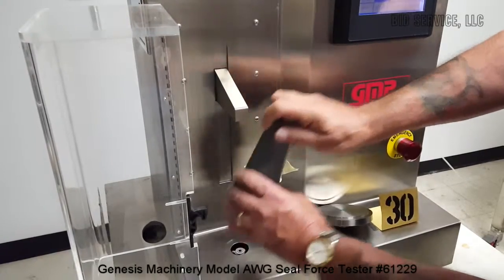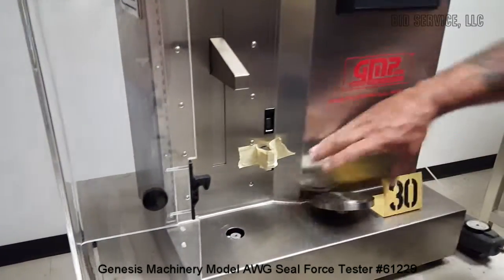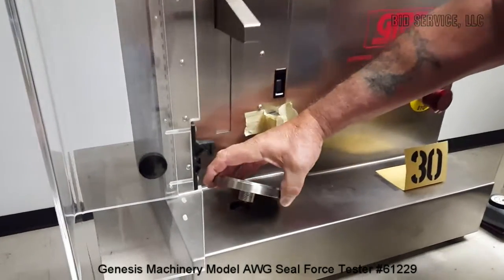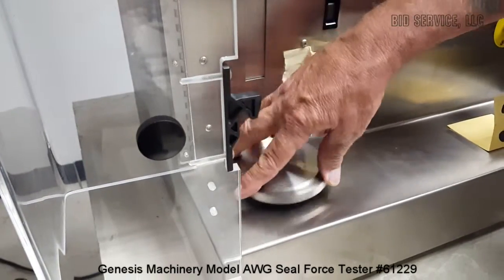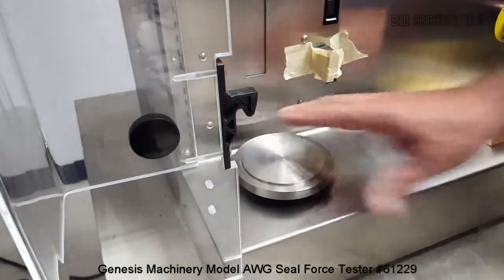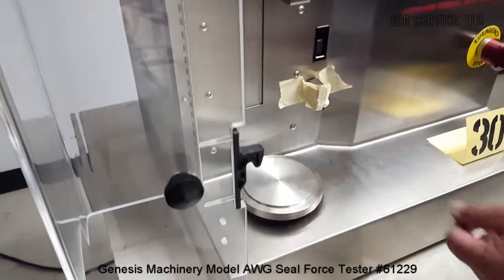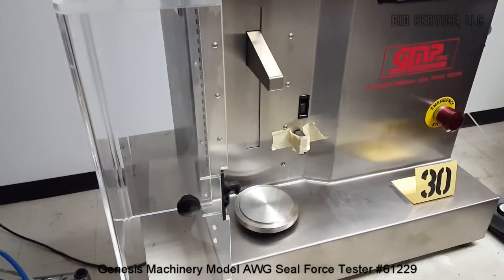You can see the arm is now out. This fixture would screw into here — this is the way you'll receive it — and then with the appropriate fixtures on here you would be able to do the testing that you desire. The arm and platform have fixtures that are product-dependent, so you would have to get the proper vial seat and cap seat for each end for whatever you're going to be testing.